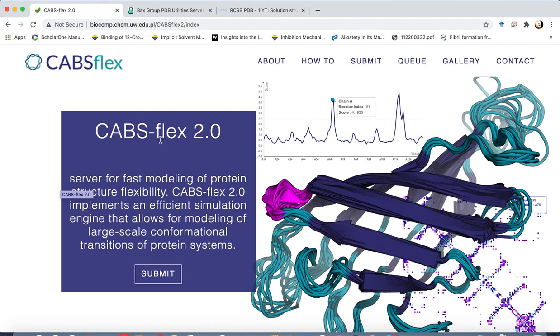However, in case of IDPs like the amyloid beta 42, the system that we will be using in this tutorial, the simulation time of evolved structures in the form of trajectory would not be an ideal representation due to the inherent fluctuating native states of these IDPs. That is, the lack of fixed or well-defined or ordered 3D structure. So the best representation of the dynamics of IDPs would be in the form of structural ensemble, from which the average properties will be calculated and benchmarked against the bulk experiment. So that's the standard procedure now for IDPs.